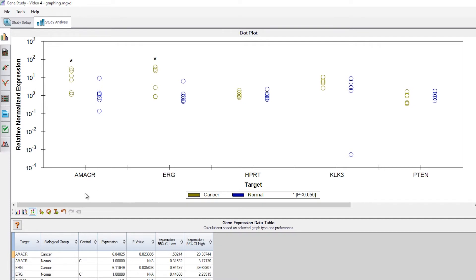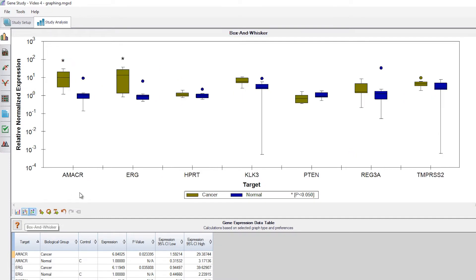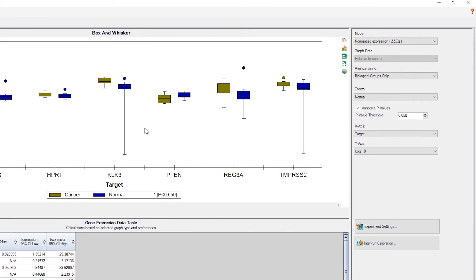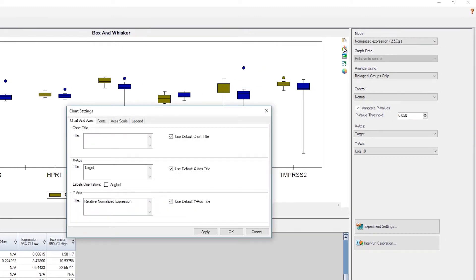Let's start by making some edits to our box and whisker plot. First, we'll add a title and make some changes to the legend. To do so, we'll click on the chart setting button. Here, we have the option to add titles. Let's call our chart Cancer vs. Normal.